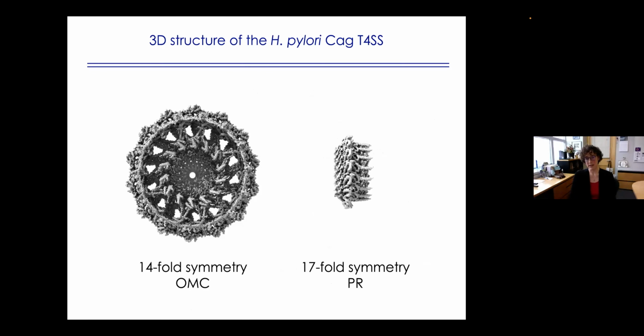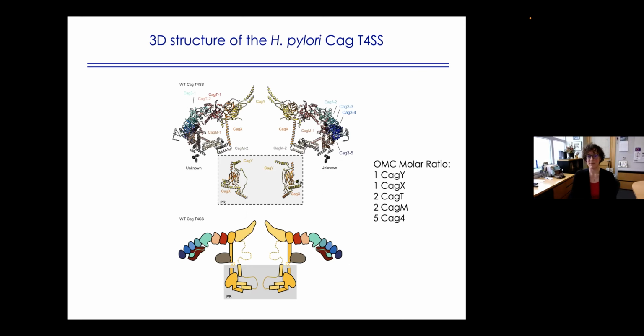And Eddie worked very hard to get the resolution to a little bit under 3.5 angstrom resolution. But with the complexity of the map and the lack of any sort of crystal detail, we needed a lot of help to build the models. And this is where Mike Shelow entered the picture, who did an amazing job building models from these very challenging maps. And I'm not going to go into huge detail about this because it's published and probably people don't care that much about the details.